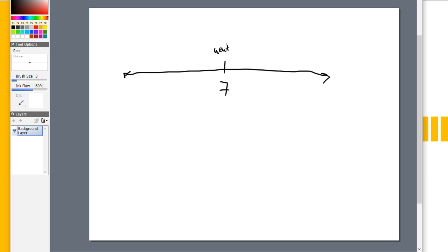7.0000000000000. That is neutral. This is what we regard as neutral, and the reason that we regard it as neutral is because this is where our hydrogen basically equals our OH concentration. That's a conversation to have on a different day. But because those two are equal, we have a pH of 7.